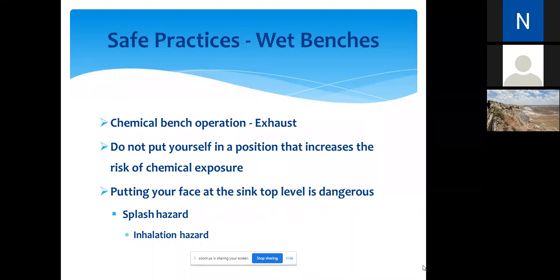The general hood has galvanized steel piping. So if you interchange and use corrosive fumes in the general hood, the galvanized steel is going to get etched and it will end up with holes and therefore render it ineffective for use. So always make sure what kind of hoods they are before you start your work. Do not put yourself in a position that will risk your livelihood.